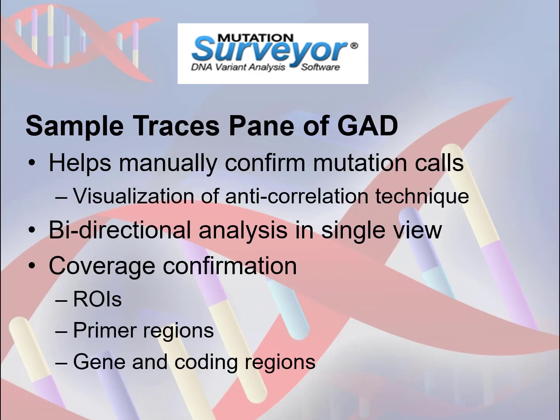The Sample Traces pane of the GAD is an essential component for project review. It allows for manual review and confirmation of mutation calls through the display of the anti-correlation technique results. Bidirectional analysis is provided in a single view by grouping the forward and reverse directional traces together to better visualize whole sample analysis for an amplicon.